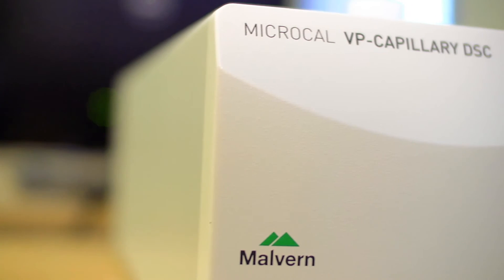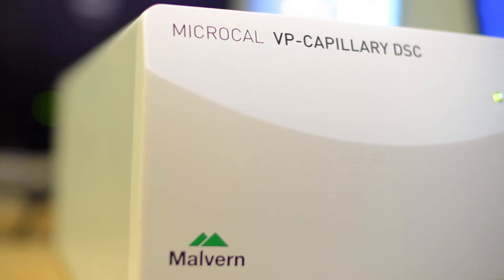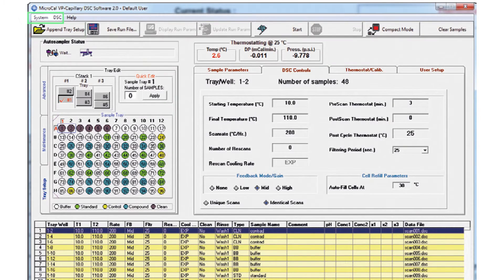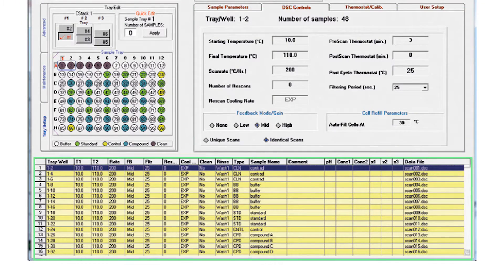The high-throughput, high-sensitivity MicroCal VP Capillary DSC system features software that streamlines workflow through simplified experiment setup and flexible instrument scheduling. Automated data analysis and improved data sorting help relieve analysis bottlenecks, reducing data analysis time for a typical experiment from days to hours.